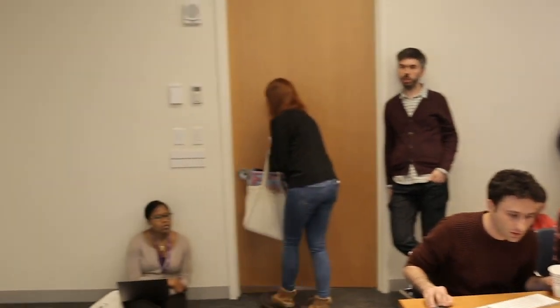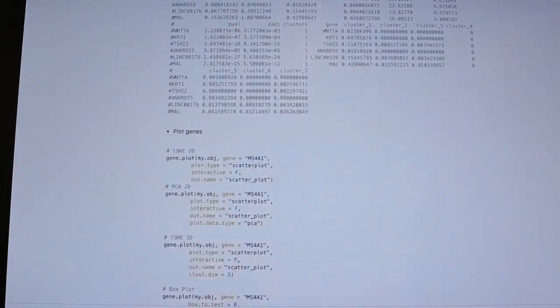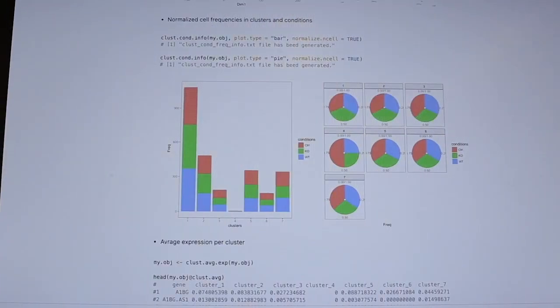In the live video you have on the top, I think that's cell gating. You could just choose your cells like this. That really shows how similar it is to FlowJo, and how powerful it is. Then you can download those IDs and rename them cluster 20 or 1 or whatever you want them. You could also do this if you have more than one sample.